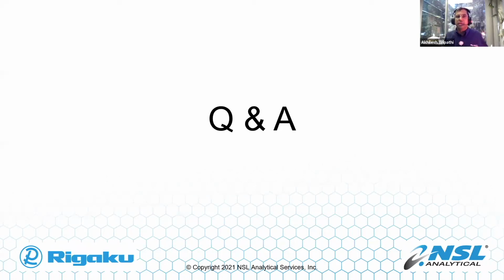Dave, I will answer this, and you can add things. Yes, XRF provides elemental analysis, and elemental information can be easily read into our software to find the compounds. I call them sort of brother and sister, because when you are looking for trace or minor phases, element information becomes very critical to find the compounds.